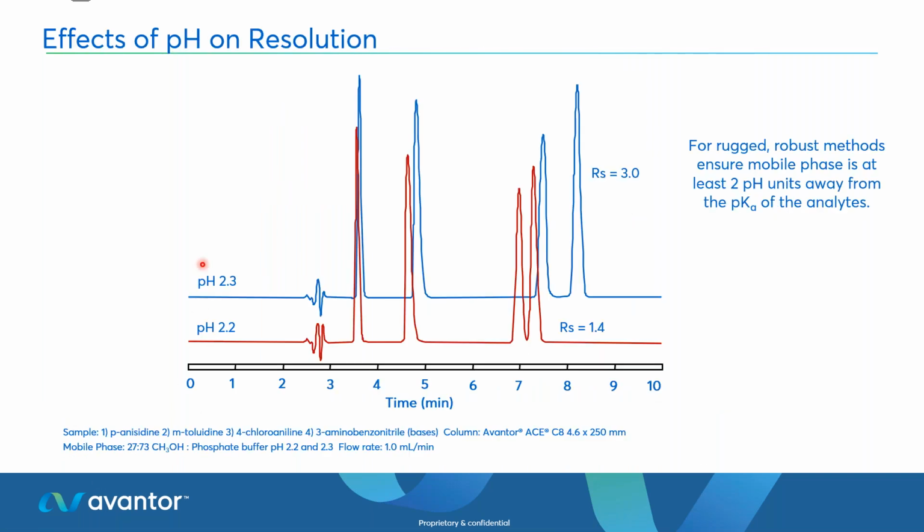Now, working near an analyte pKa can be pretty problematic, and you'll see this. You kind of know in your chromatography whether you are near an analyte pKa if you see these big differences when you have very small differences in pH. So here, got a pH 2.2 going to pH 2.3, and hand on heart, how well do we make up our buffers? What's the accuracy? Could that first one be pH 2.25, and then the next person makes it up and it's 2.20 or 2.19?